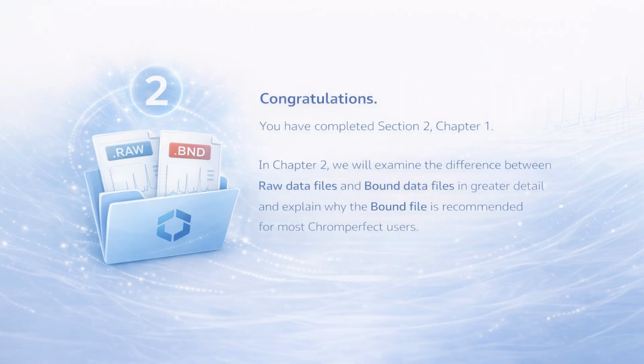Congratulations! You have completed Section 2, Chapter 1. In Chapter 2, we will examine the difference between raw data files and bound data files in greater detail and explain why the bound file is recommended for most Chromperfect users.